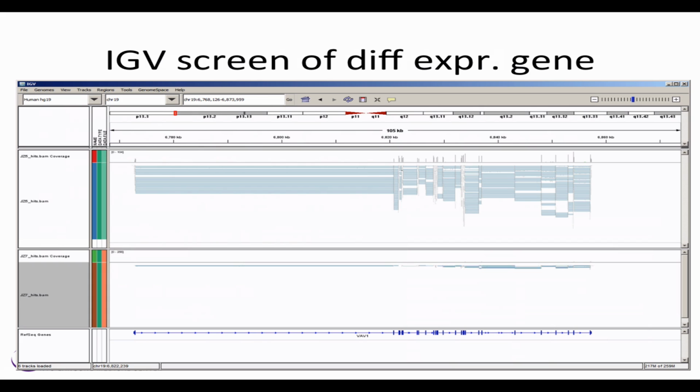Expecting the fact that you're going to see 0.5% random sequencing error, you may see a number of positions where your read differs from the reference genome. This could be a true allelic variant. Why not? There's more than one sequence in the population.